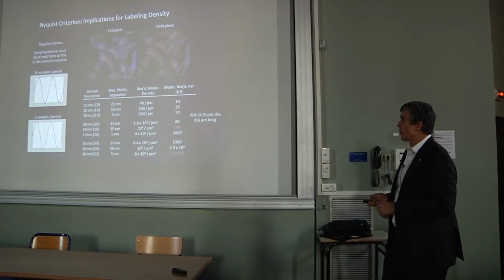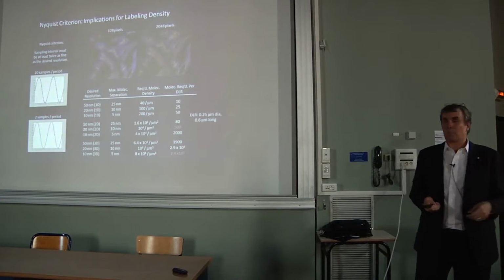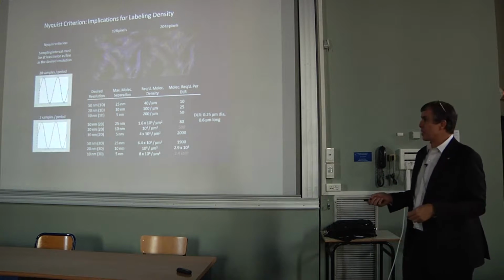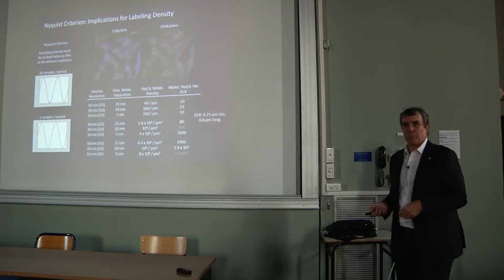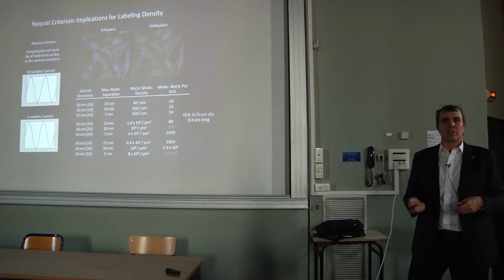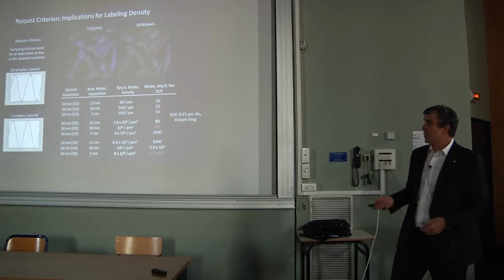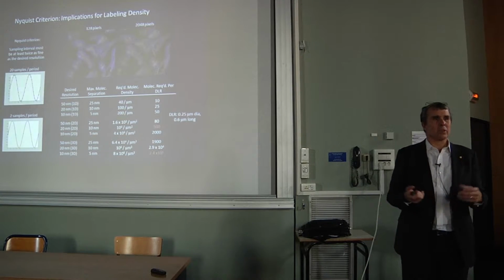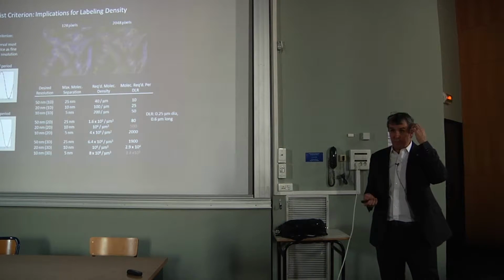So as I mentioned before, one of the major problems of any form of super resolution, not just this PALM technique, is that you have to have a very dense number of fluorescent labels. If I had a sine wave here and I sample it only every half period, I could miss that pattern altogether. That's what's known as the Nyquist criterion. If you want resolution X, you have to sample at least every X over 2. So if I want 20 nanometer resolution in a diffraction limited spot, that would mean I'd have 500 fluorescent molecules. And I need to be able to see one on top of that 500.